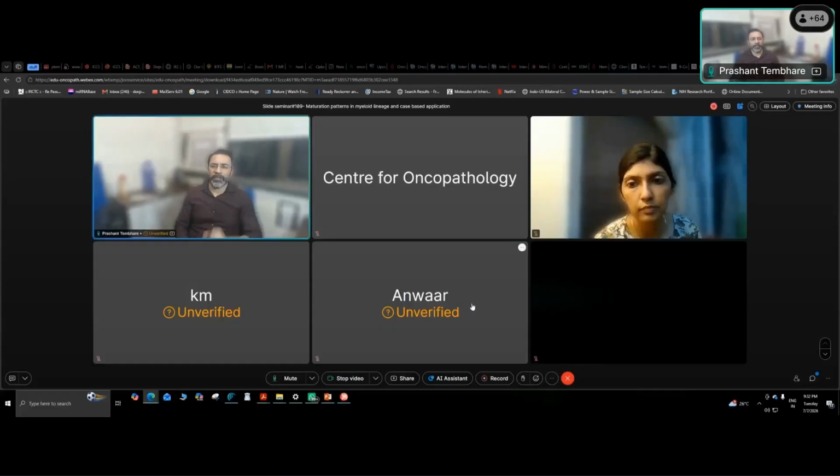And the second question is megakaryoblastic leukemia. So if you take blast, the blast shows typical expression of CD34, CD117, sometimes HLA-DR negative, and you have CD13, CD33 expression. But then majority of blasts will show megakaryocytic marker like CD36, CD42, CD41, CD61. These are megakaryocytic markers. Now you have to have high degree of suspicion of megakaryocytic leukemia.